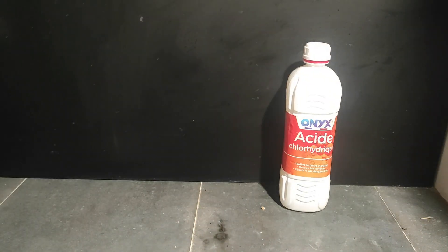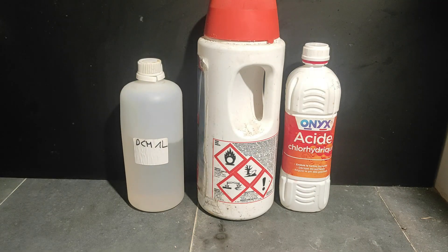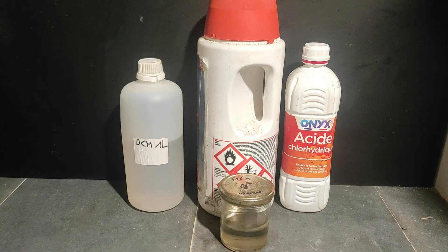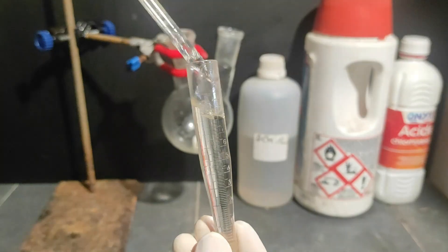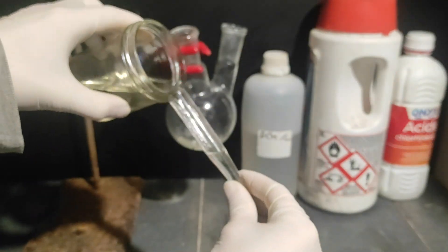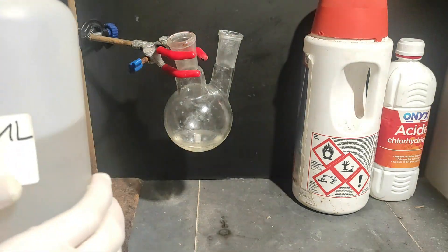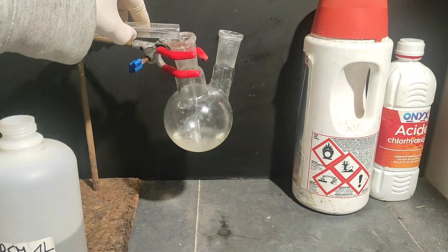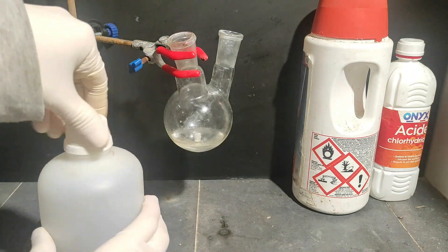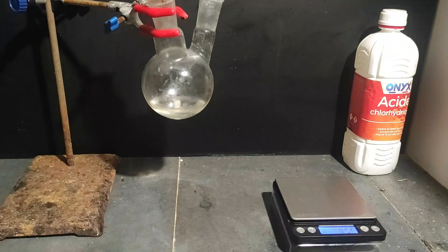Now on to the second step. The reagents we need are the styrene we made, some hydrochloric acid, some calcium hypochlorite, and optionally some dichloromethane. I start by measuring 20 ml of styrene in a graduated tube and pour it into the round flask. Then I measured 10 ml of dichloromethane, which is not really a reagent in this reaction — I'll explain its purpose later. Then I measured 12.8 g of calcium hypochlorite on the scale and added it to the flask. It's not going to dissolve in the styrene/dichloromethane mix, but that's normal.